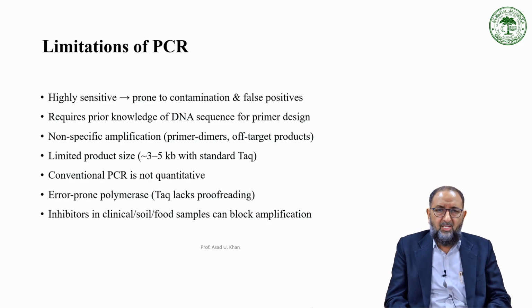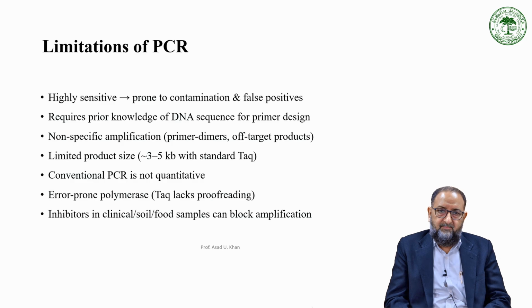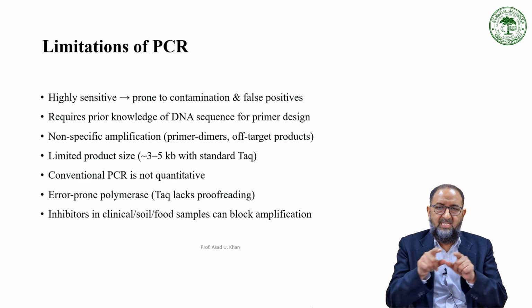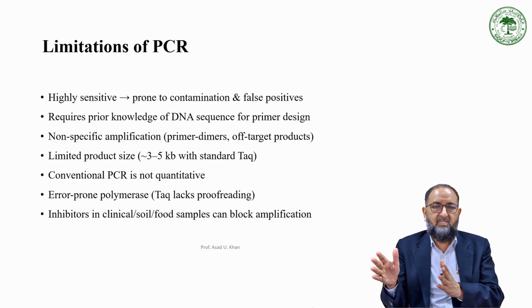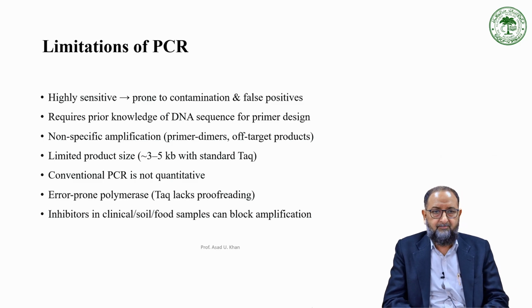It requires prior knowledge of the DNA sequence. Without prior knowledge of the DNA sequence, you cannot design primers. This is one of the challenges or limitations. Non-specific amplification, primer dimers, off-target product formation. It may have this because sometimes repeats of ATGC are present, and those repeats might bind to off-targets.